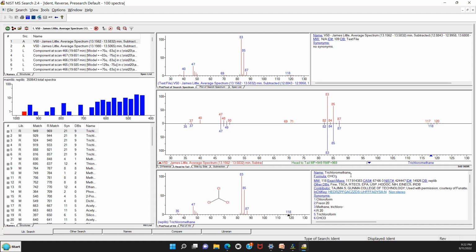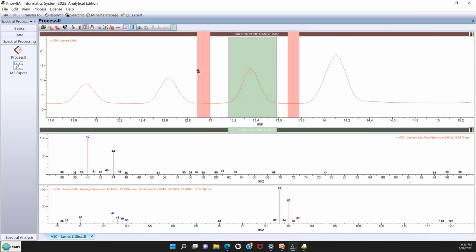So now if you want to go back to get another spectrum, there's an arrow, if you look up at the top here, called Switch to Caller, and it knows how to go back to the program that sent it the spectrum. So you just go back, and now you're ready to get another spectrum.